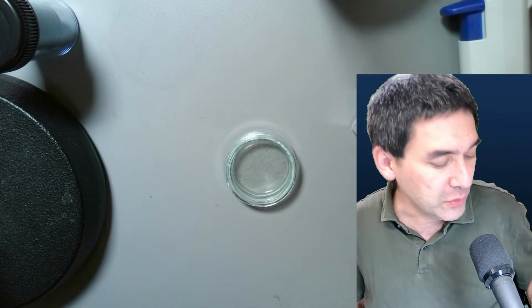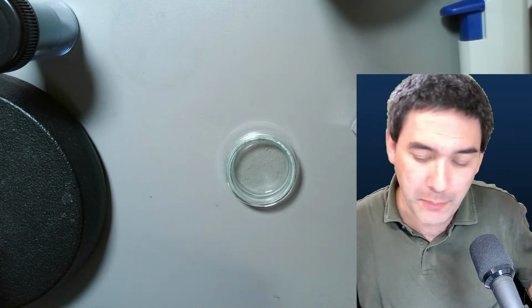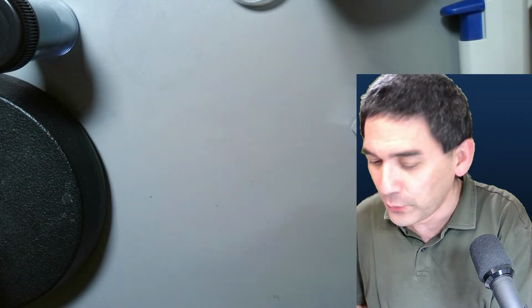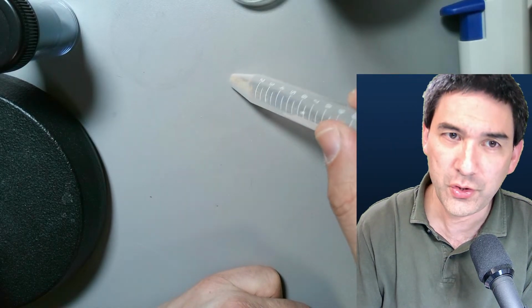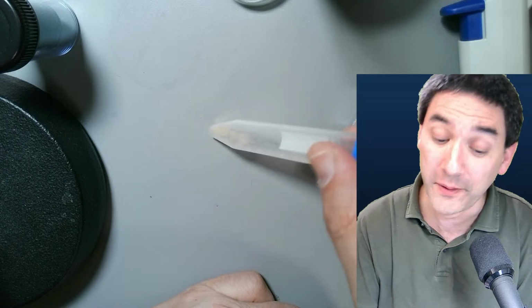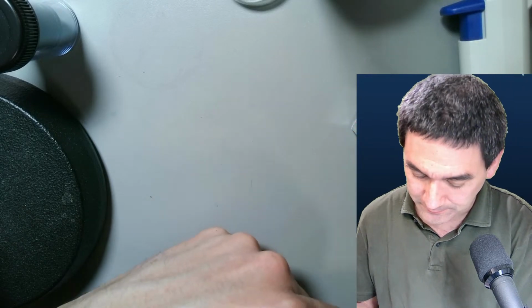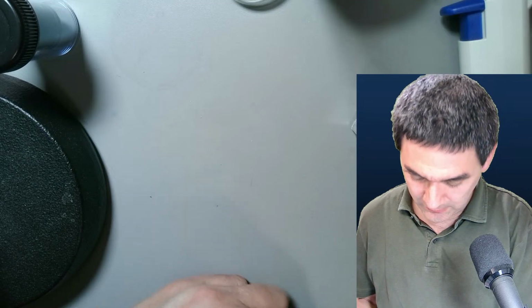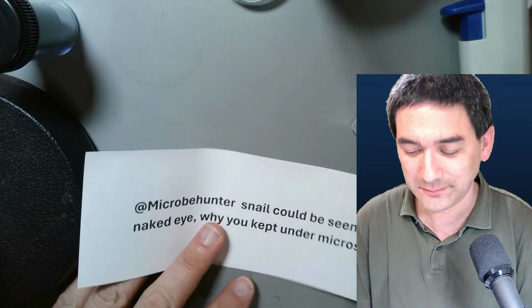I decided to do a little theory part for a couple of minutes in each live stream. And then later on, I want to put this sample under the microscope here, which is not Sahara sand. I'm going to tell you why I was hoping for Sahara sand. And this is a question that I got.